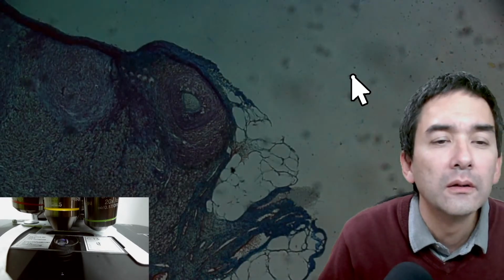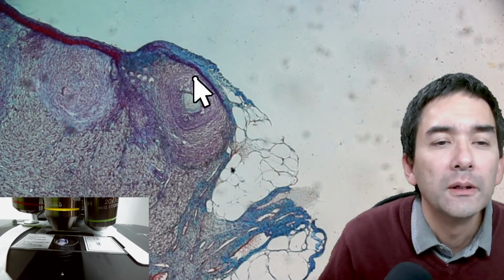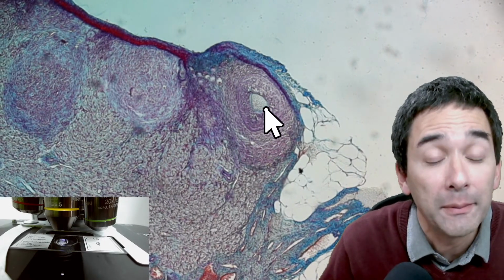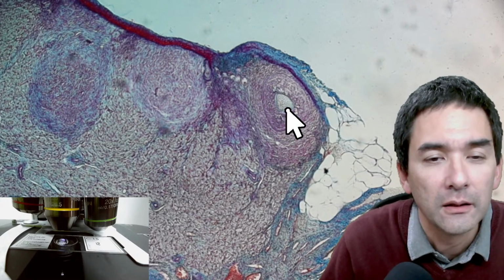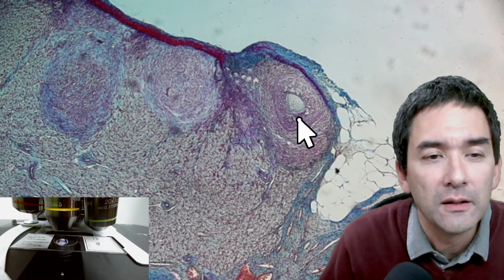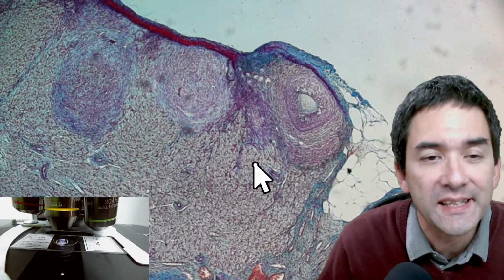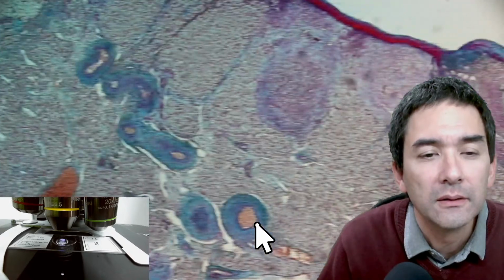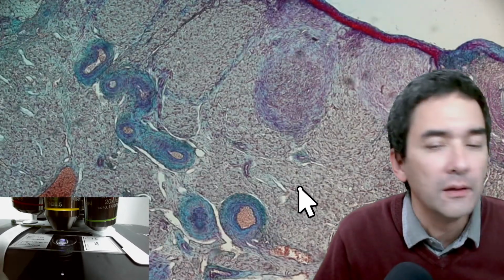Okay, it could be that this is a follicle. I've had another slide, I don't know where I've seen this, of the ovary of a rabbit, which is again a little bit bigger, but I saw that there were several of these follicles because several egg cells were being produced at the same time. So this is an ovary, again blood vessels here. Okay, and if you zoom in, what do we see again? All of those dots, cells.